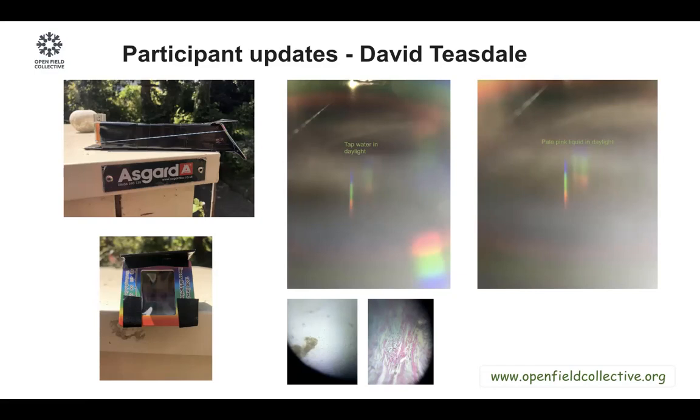But there are some problems. One is that there is stray light coming in from one of the corners. I know what that is now because I've experimented a bit further. Basically, I don't have enough hands, so I'm steadying the spectroscope with one hand, and I'm going to press the button to take a photograph.